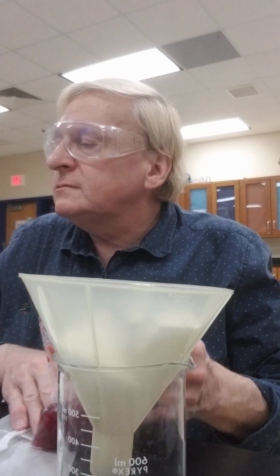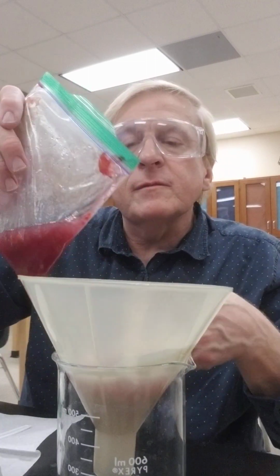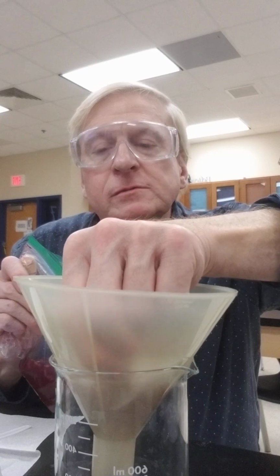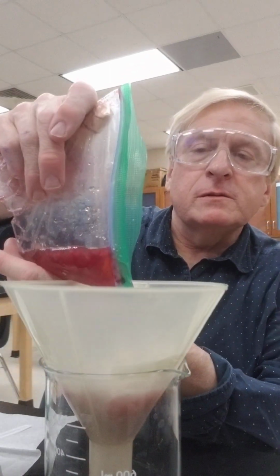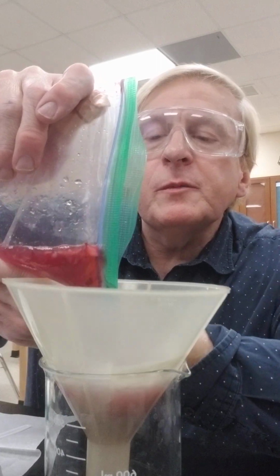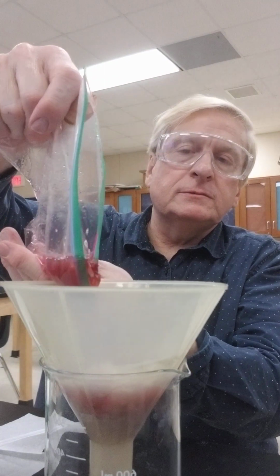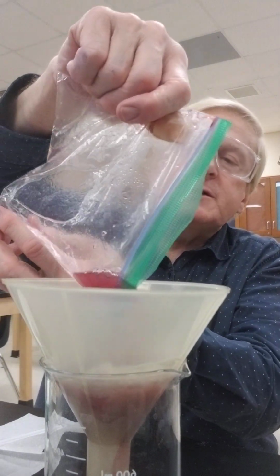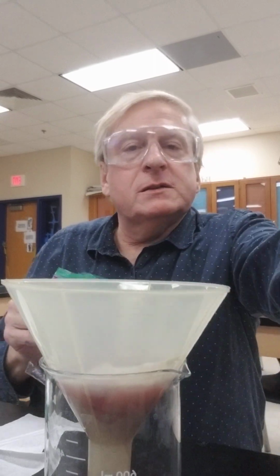Now you want to make sure the strawberries and the strawberry mash all goes into the filter paper and not around it. So you need to use some care doing this. I'm going to pour it into the filter paper. Let it drip through. I may not use the whole strawberry smash this time because, well, let's see. It's going through fairly well. We may be able to put it all in just a little bit at a time, so you don't overwhelm the filter paper and have strawberry particles that you don't need going down into the bottom. You need to wait for it to drip through. I'm going to be able to get it pretty much all in here, I think. I just had to do it a little bit at a time to avoid too much breakthrough and mess.